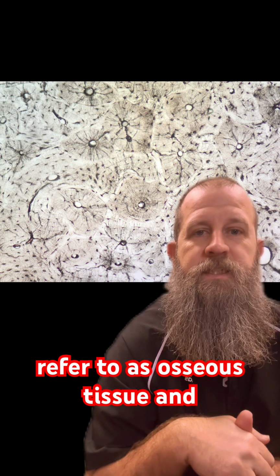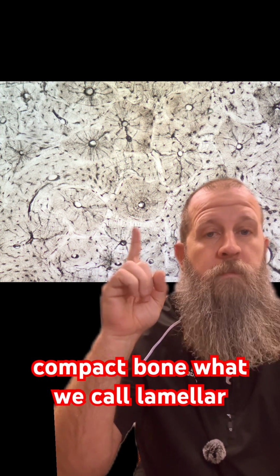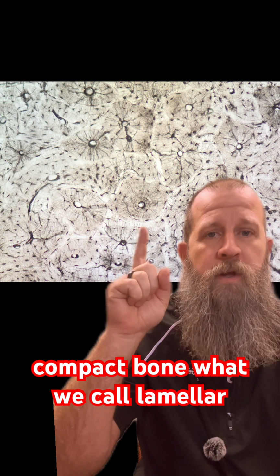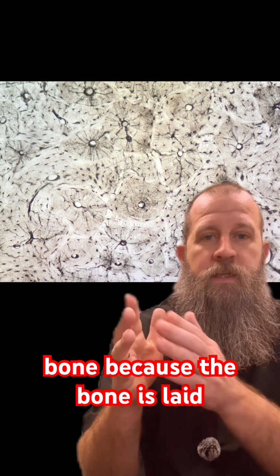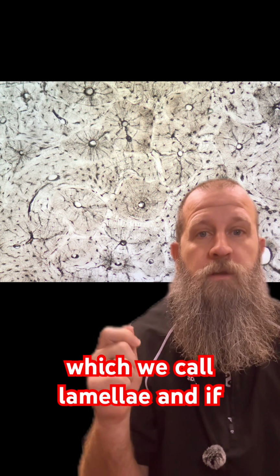Today we're looking at some bone tissue, or what we refer to as osseous tissue. This is a section through compact bone, what we call lamellar bone, because the bone is laid down in long linear strands, which we call lamellae.